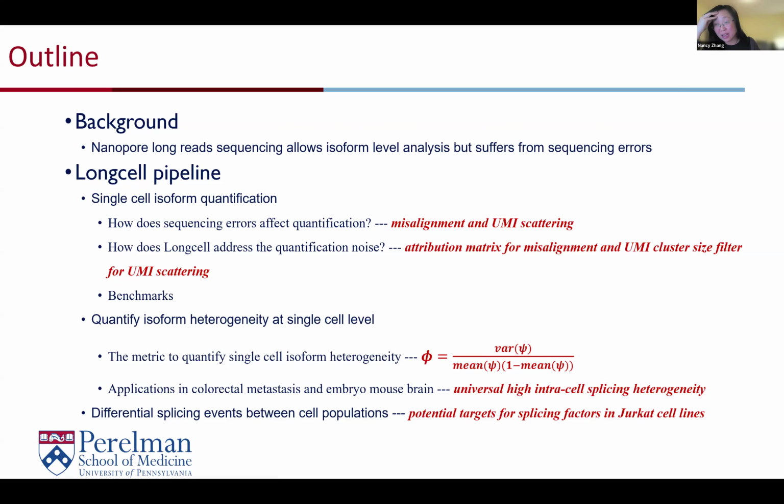One is where you have an alternative splicing event that defines new cell populations. The other is where multiple splice variants of the gene are both fundamentally kept in the cell, right? They're made and kept in the cell, so there must be some functional relevance. Yeah, we don't know what the true biological reason of it is yet.